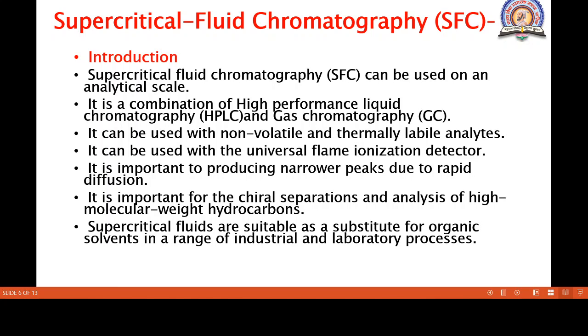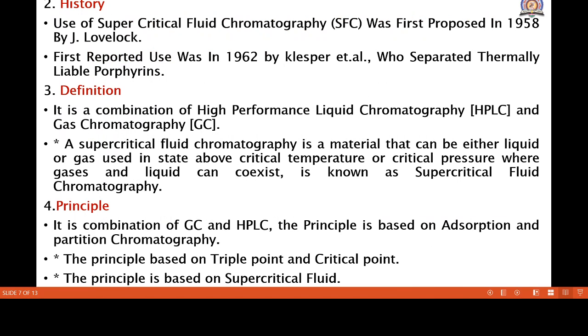Then the universal flame ionization detector can be used, means in the instrument of this SFC, we use the flame ionization detector. The important point is that it shows narrower peaks due to the rapid diffusion. Whatever peaks are obtained at the last, they are narrower. Okay, so this is the introduction.